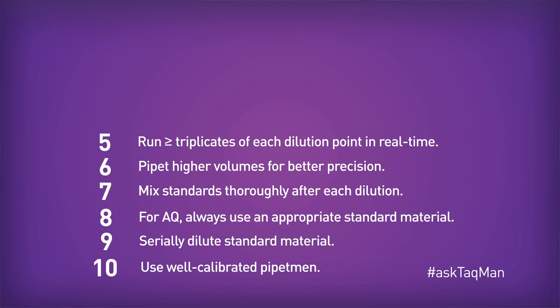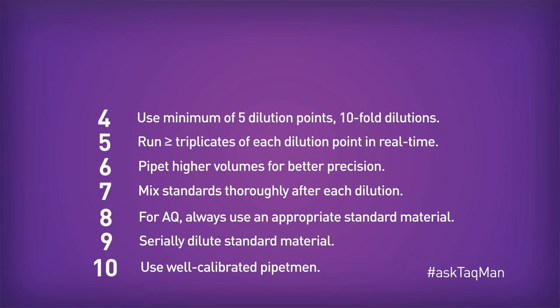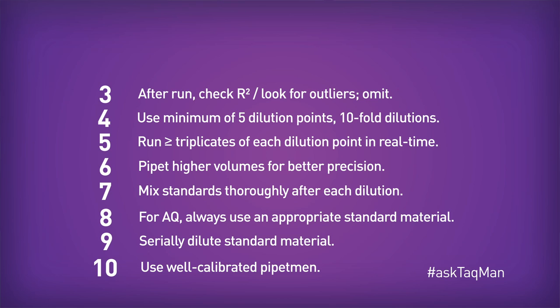Number 6: pipet higher volumes for better precision. Number 5: run at least triplicates of each dilution point in real-time. Number 4: use a minimum of 5 dilution points, each of which has at least a tenfold dilution. Number 3: after the run, check your R-squared, look for outliers, and omit them.